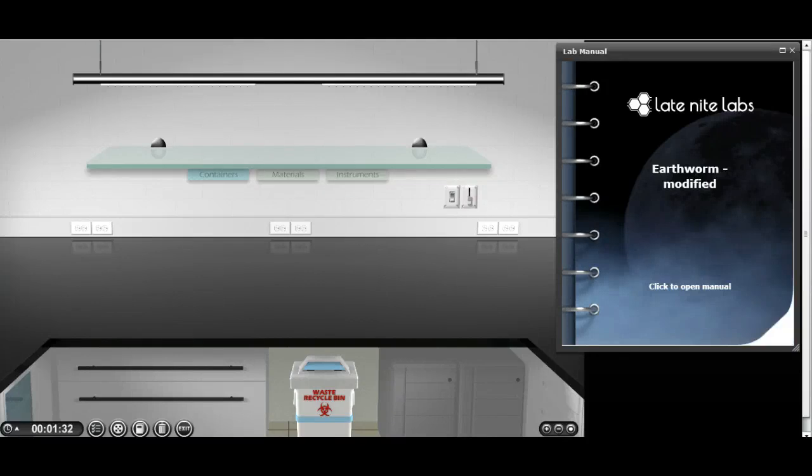Hello, I want to walk you through the Earthworm Lab and mainly show you some of the parts that you're looking for. So let's go ahead and get started.